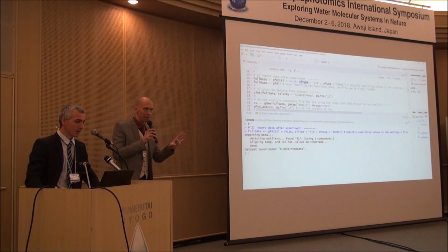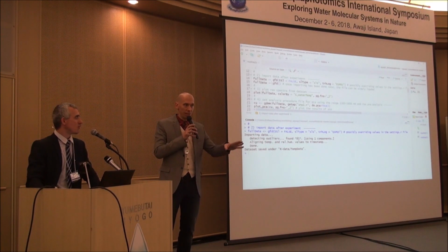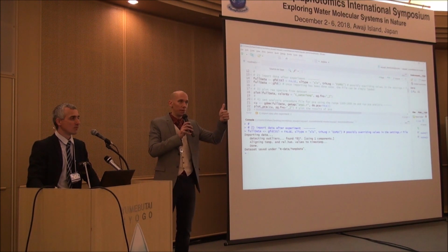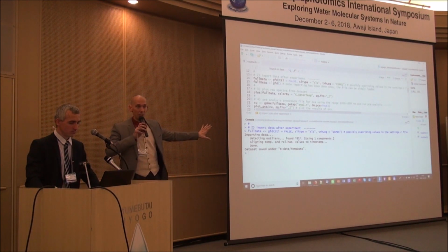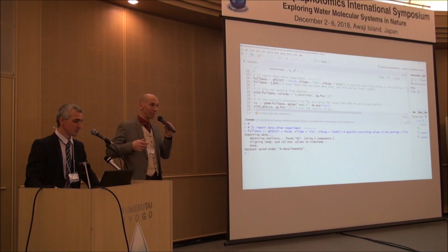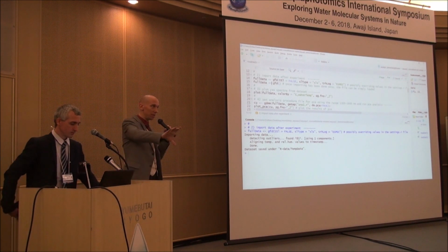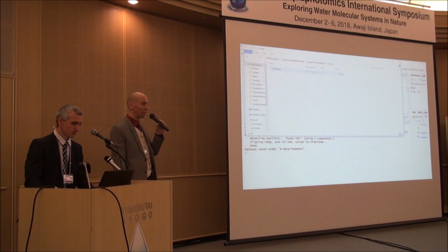So to really make it clear, the nice thing of this is you have a set of raw data, many files with your spectra, and you have this Excel file that tells you exactly, describing the sample. What aquap2 now did for you, what we just watched, it actually fuses together those two files. Additionally, fusing according to a timestamp, if you have your temperature data, so that in the end you have a block of data describing your data, having the temperature, some other things, plus of course the spectra.